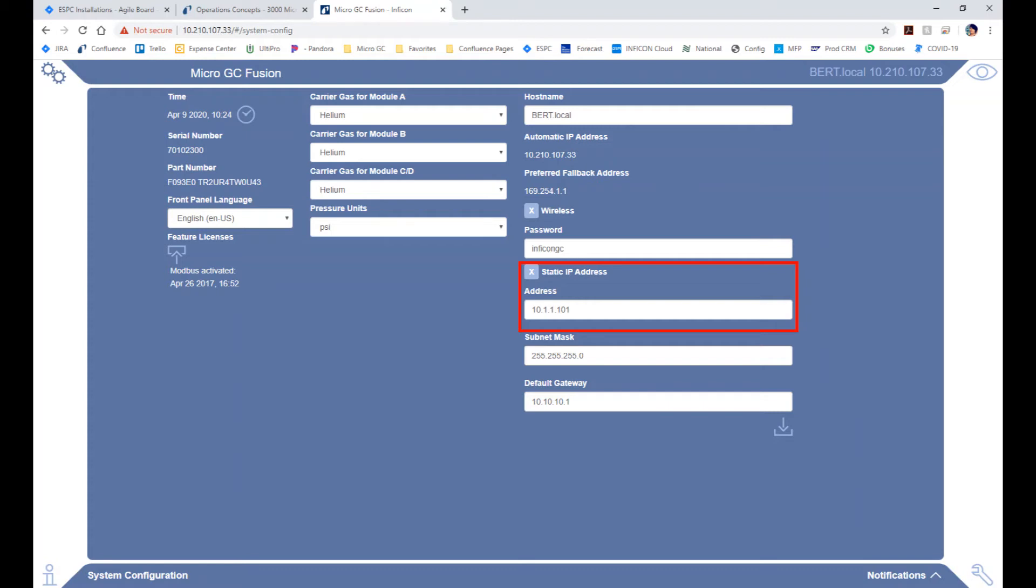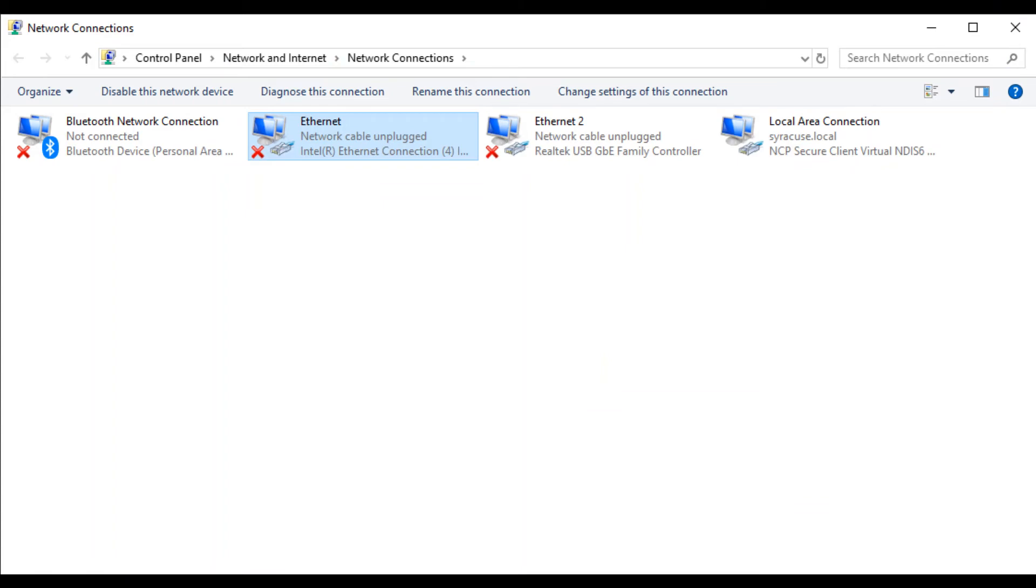In this example, we are using the static IP address 10.1.1.101. You will want to note that in this case, the computer's local area network must be set to see MicroGC Fusion's IP address. For example, if we set the MicroGC Fusion to 10.1.1.101, we must set the computer's Ethernet adapter in order to see the GC.